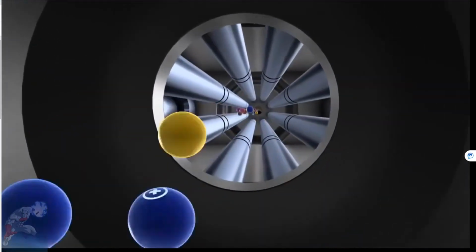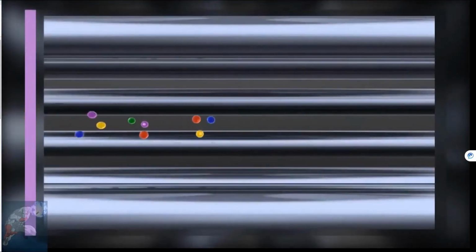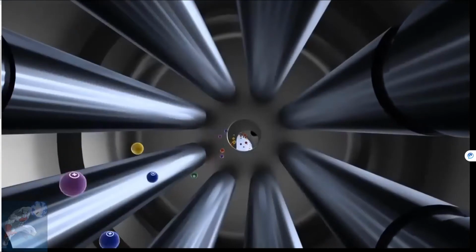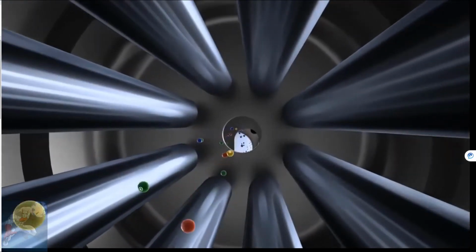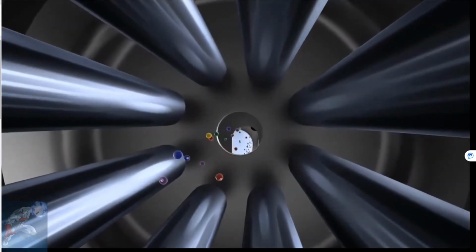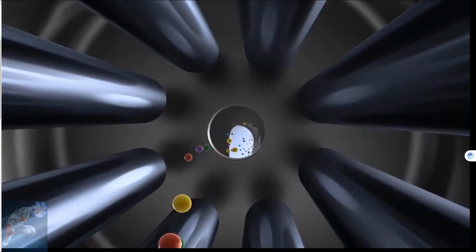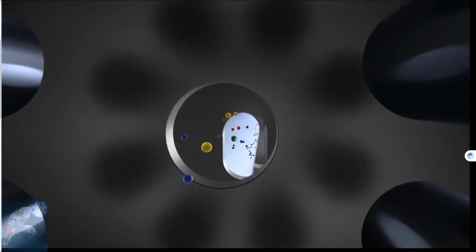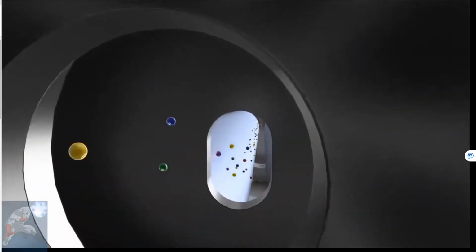Inside the vacuum chamber, the ion stream passes through a collision cell where a helium collision gas is introduced. Helium is used to filter out large polyatomic ions, or ions with more than one atom bound together. These polyatomics are very large compared to the unbound ions, and therefore will have a greater number of collisions with the helium gas. The polyatomics lose so much kinetic energy from the collisions that they cannot escape from the cell.